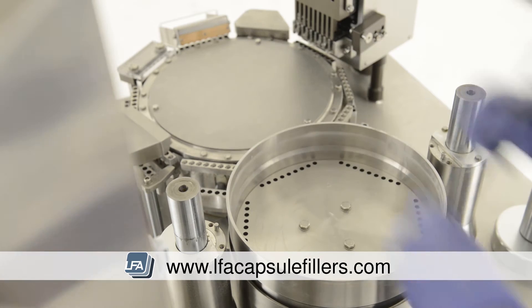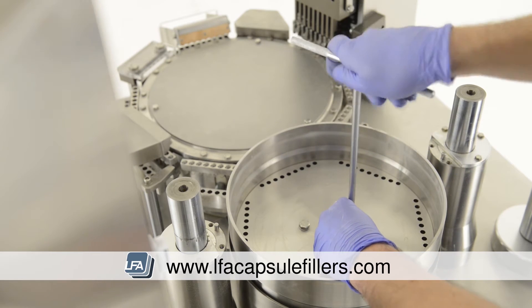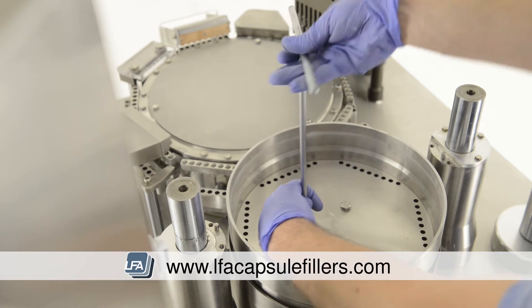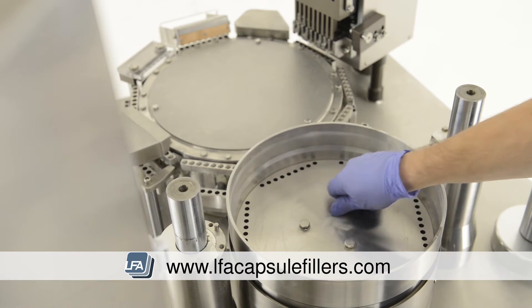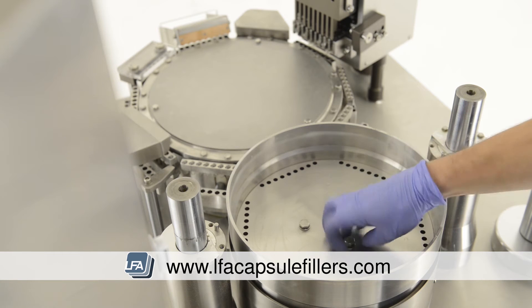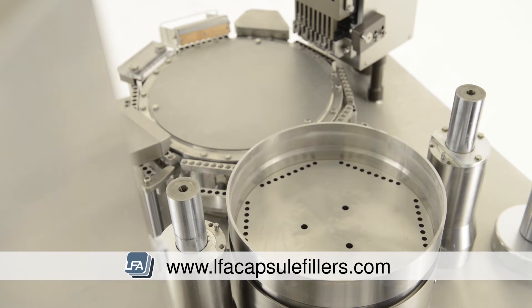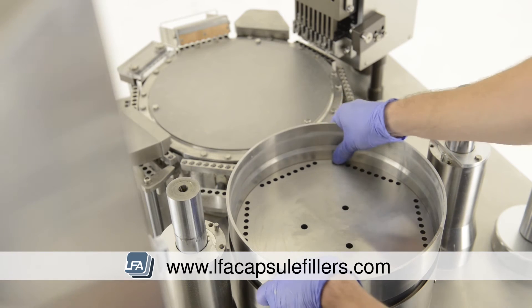The bottom section of the tamping turret requires a special tool that comes with the FACF. Take this and remove the three 14mm bolts. You're then able to lift and remove this section.